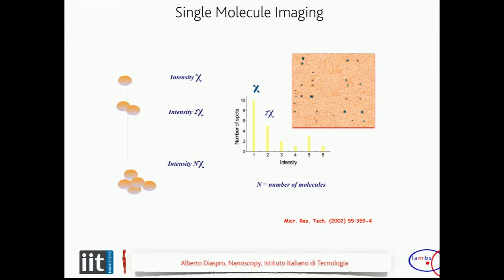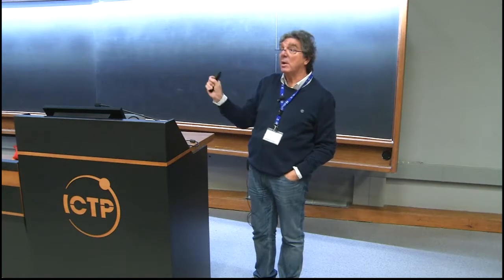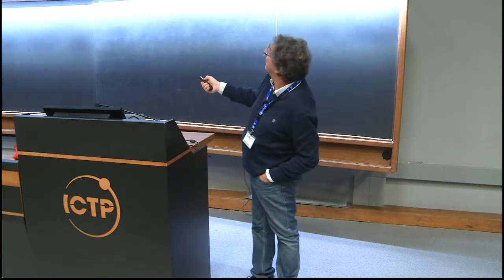And in this case, you can recognize on your cover slip or in your system by intensity where the single molecules are. So they are the only ones having one signature.